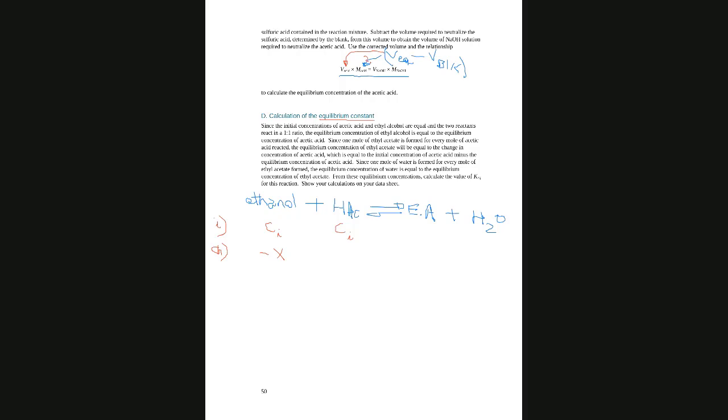So I heat it in order to produce some products. It doesn't go all the way to the end, but there is an equilibrium where the concentrations do not change. Because it's the same concentration, the change is this, and whatever I lost here, I gain in the product.